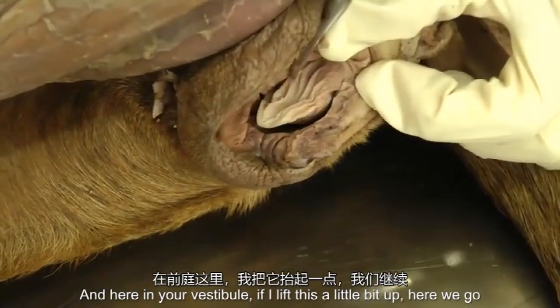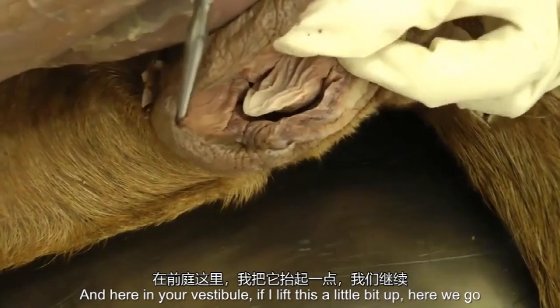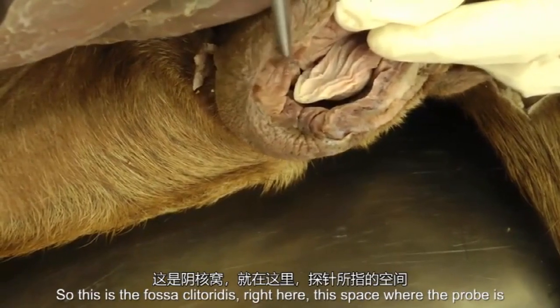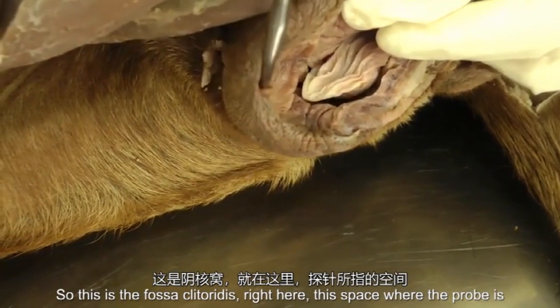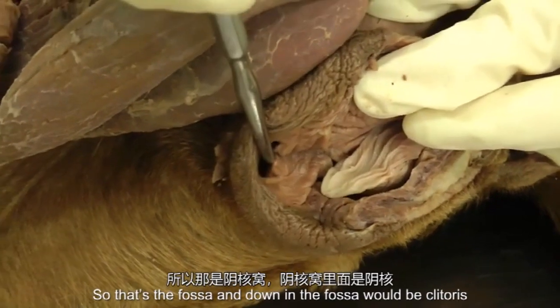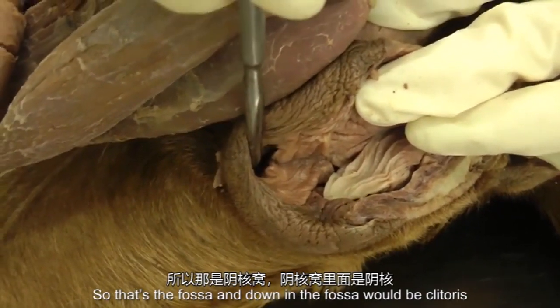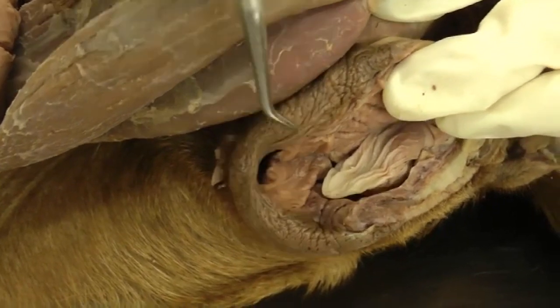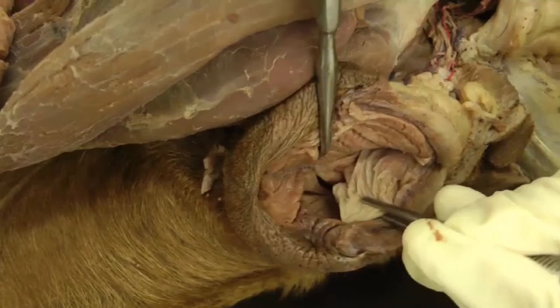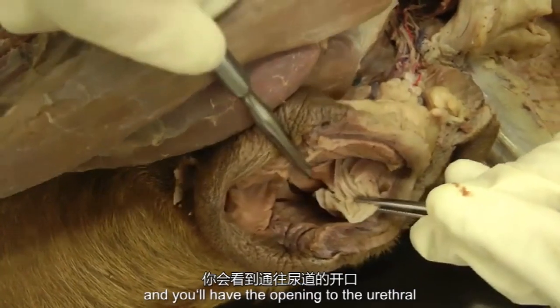And here in your vestibule, if I lift this up a little bit, here we go. This is the fossa clitoridis right here, this space where the probe is. That's the fossa, and down in the fossa would be the clitoris. All right, then we go back up to our urethral tubercle, and you'll have the opening to the urethra.